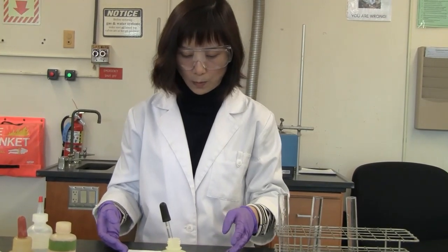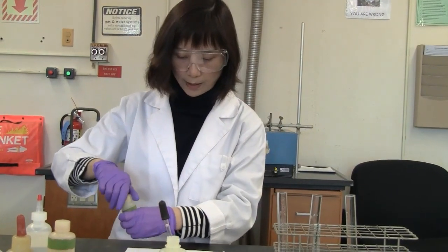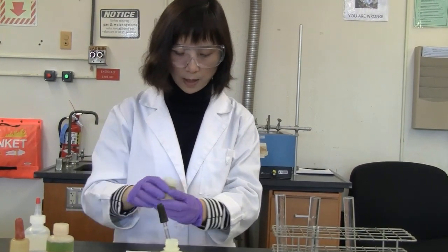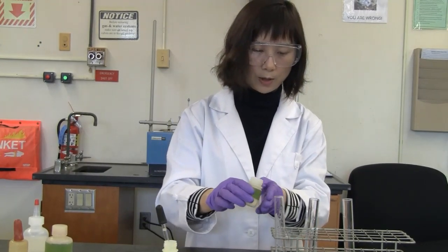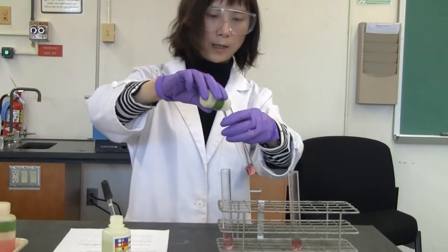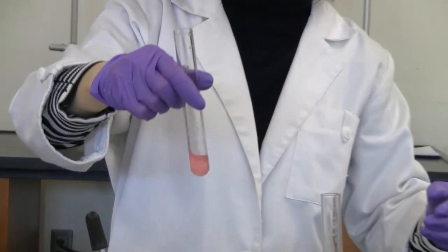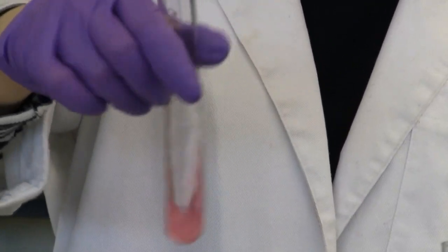To the second test tube, add 1.5 grams of the ammonium chloride and shake it to make a saturated solution. So number 2, I'm going to add kind of a piece size of it. Okay, let's fix that. So if you see some of the solid stay on the bottom, that means it's saturated. It cannot dissolve more. Okay, then compare the color to the original.